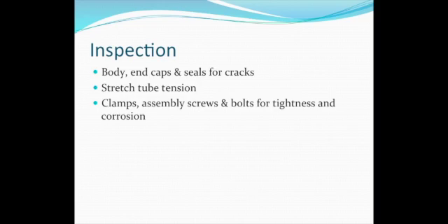It is important to inspect the equipment prior to use to ensure it can collect samples without leaking and does not have corrosion which could interfere with the analytes of interest. Look it over for cracks or worn seals. Verify the stretched tube has enough tension to close under water and tighten any loose parts.